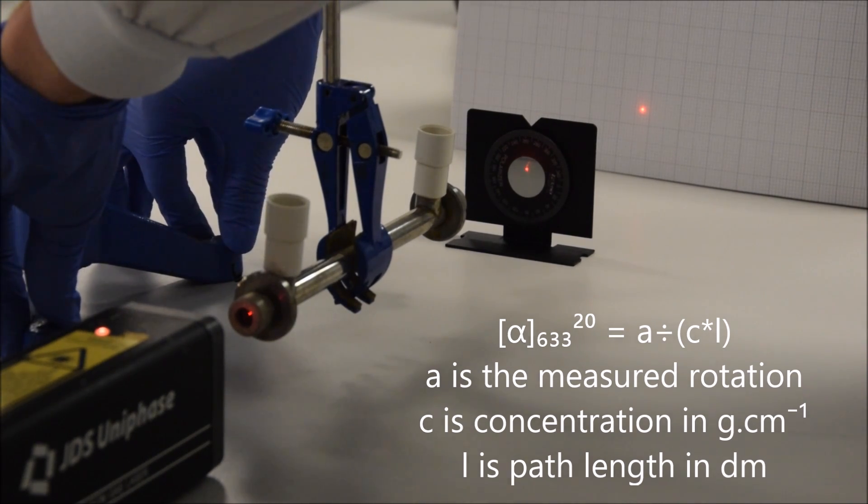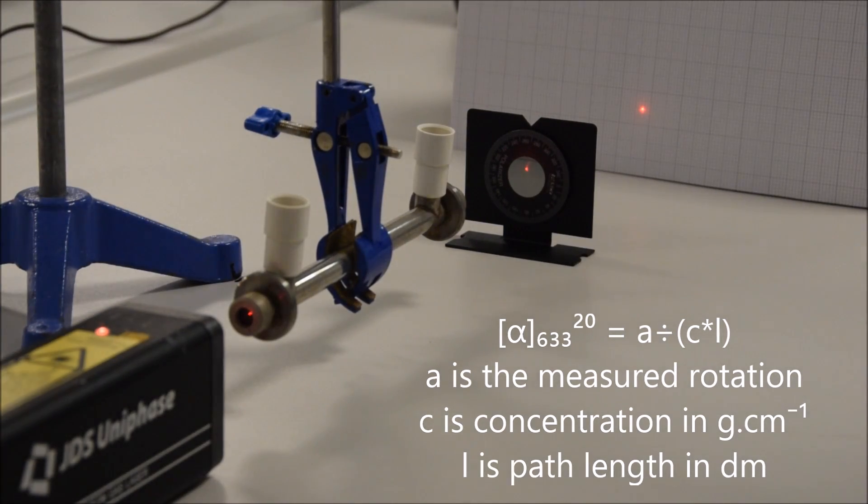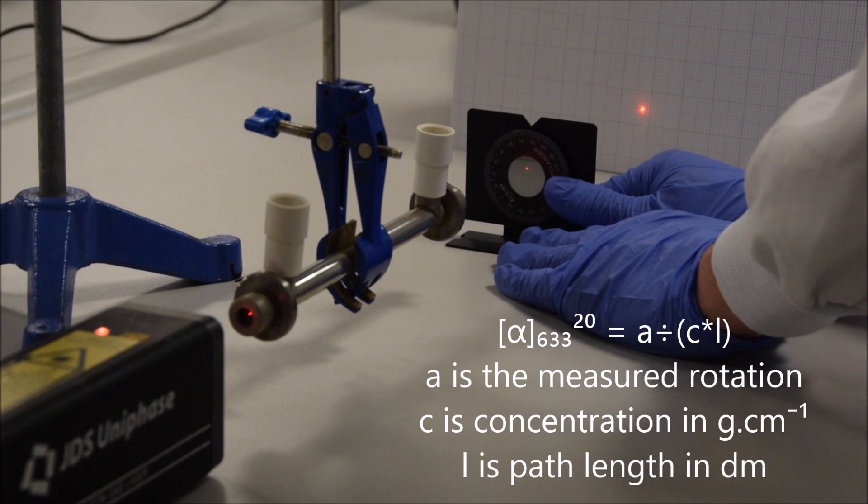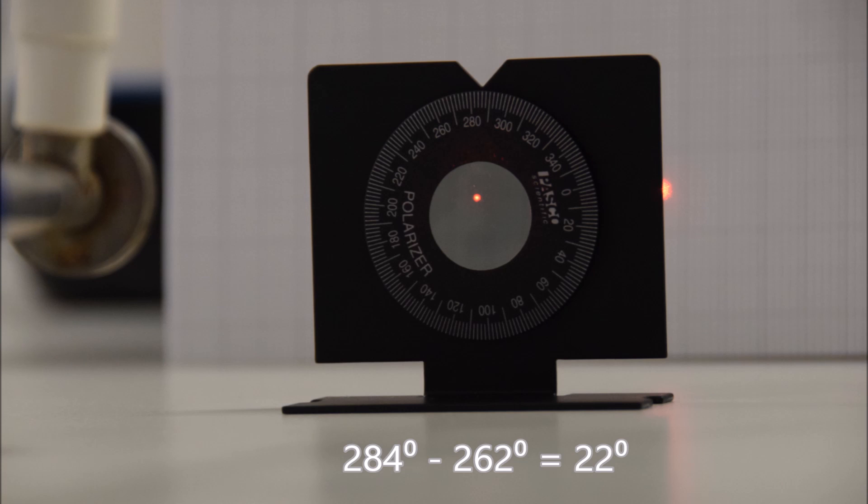This is because the plane of polarization has turned and so the polaroid is not lined up exactly to cut out all the light. If we rotate it, we can find an angle where the light is going to be cut. The light is still polarized, it has just changed the angle of its polarization. If we find this angle now and measure it, we can see that if we take our initial angle from our final angle, we can get the difference. And this is our rotation.